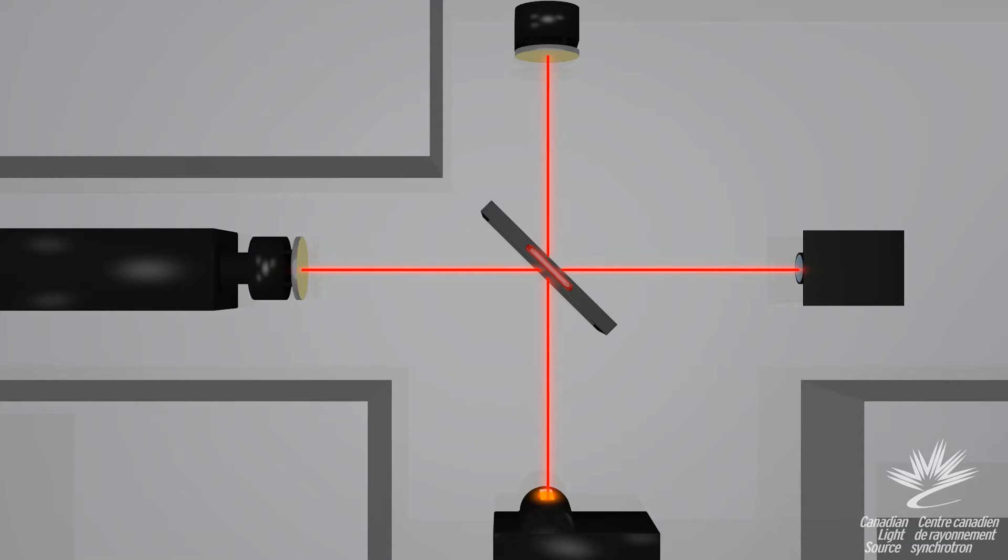The moving mirror slides back and forth, causing one of the beams to take a slightly longer path before recombining. This creates interference.